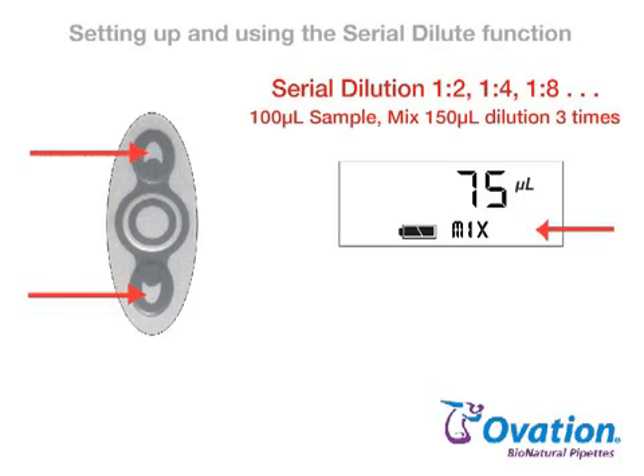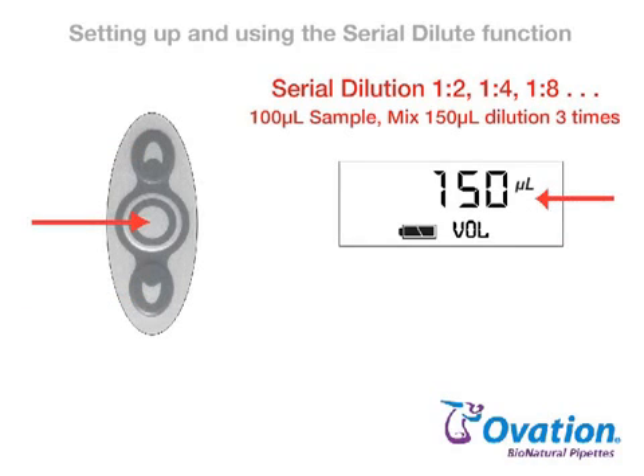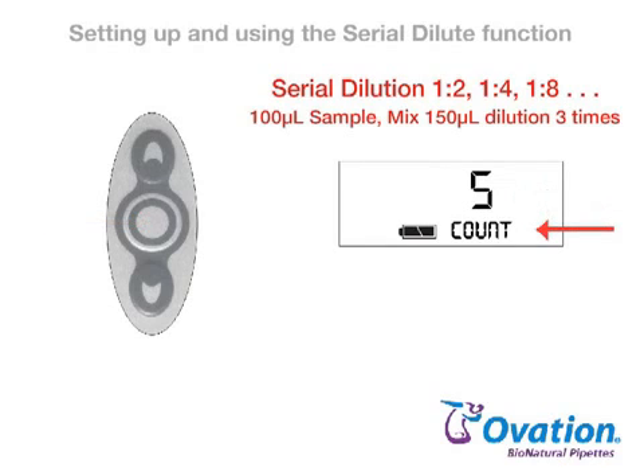Press the up or down arrow until the desired mix volume is displayed. Press and release the center button to lock in the new mix volume and advance to the current count setting. Press the up or down arrow until the desired number of mix cycles is displayed. Press and release the center button to lock in this new count setting and advance to the current speed setting.